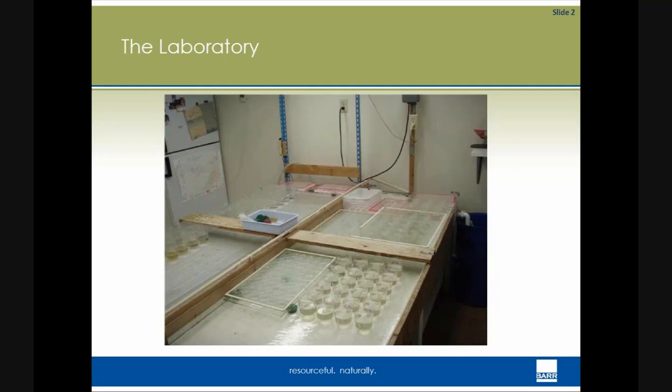The other type of testing that is often done is called flow-through testing, where water flows through a given tank. That kind of testing is usually done for fish, and is not so applicable for algae or Ceriodaphnia dubia. This testing is usually used for compliance type testing. So it's a well known and well established type procedure.